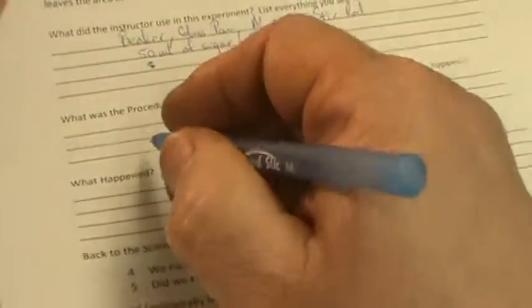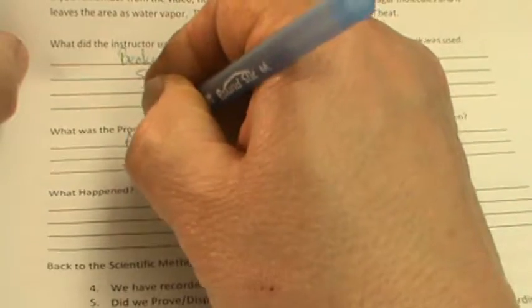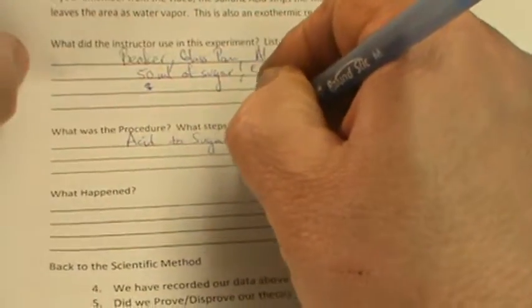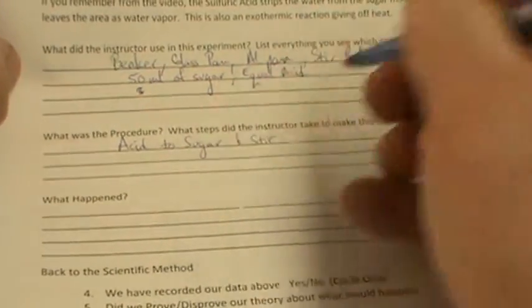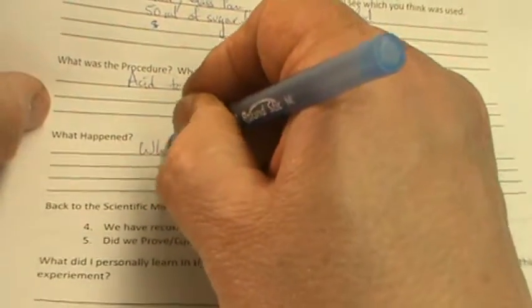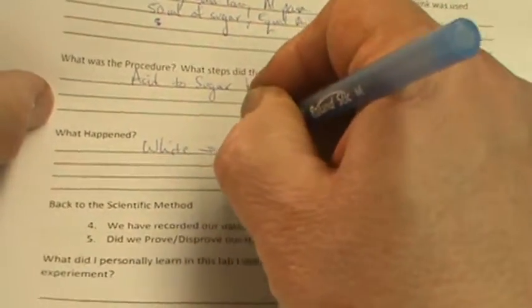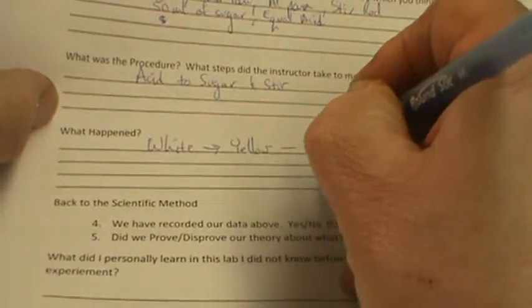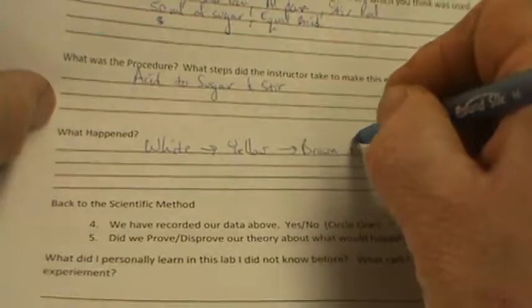Oh, sorry. So what was the procedure? What are the steps? Well, acid to sugar and stir, and then we waited. What happened? As you'll see in the video, it goes from white to yellow to brown to black.